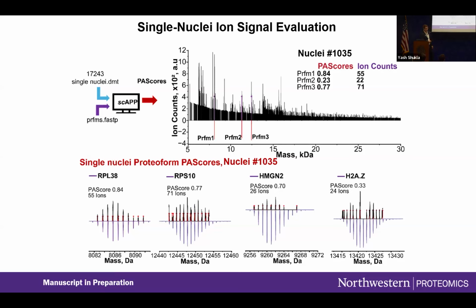Do we get the relative abundance that we'd expect toward the center of this Gaussian isotopic distribution? And what's the accuracy of these individual ions to the actual individual isotopes of our theoretical distributions? That all goes into the scoring. Here on the left-hand side, you can see a rather high score. It scales from about 1, which is 100% confidence, down to 0, which is 0% confidence.